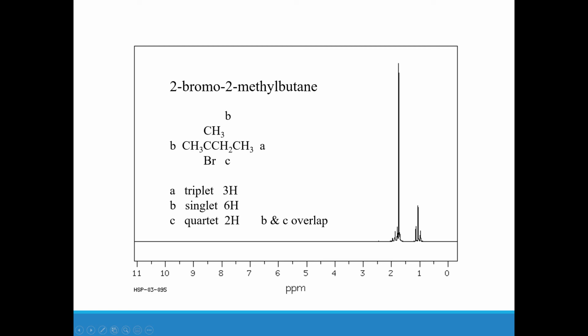So let's look at B. We have the 3 hydrogens here that do not have a neighboring hydrogen, because if it did, it would be right here. So these are on their own, so they should be a singlet. This really tall peak is our singlet. Meanwhile, this hydrogen here that has 3 neighbors, so 3 plus 1 is 4, is a quartet. You can kind of see them here: 1, 2, 3, and then the 4 would be right here. So signals can overlap on each other depending on how the atoms are arranged.